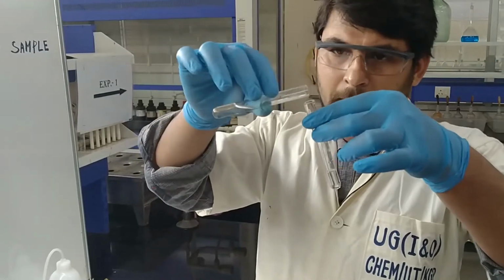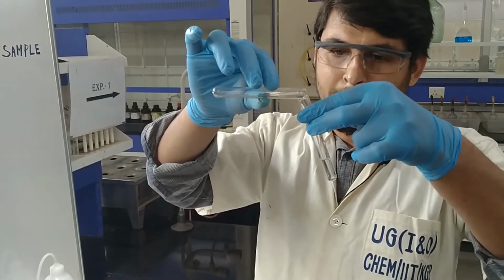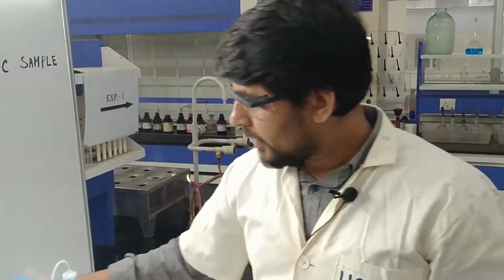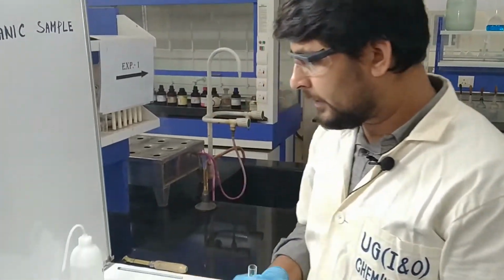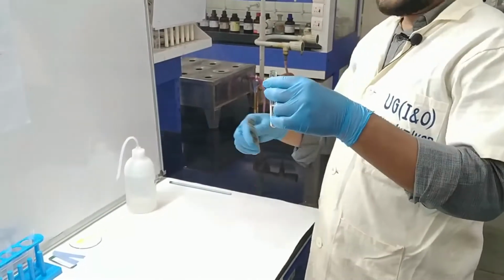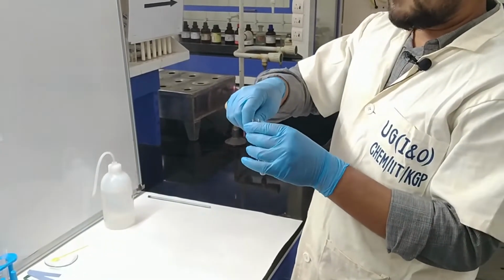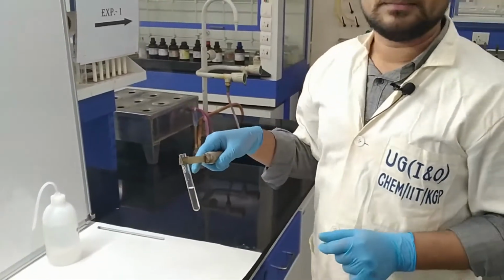This is the Tollens reagent. And this we have to heat in the hot water bath.